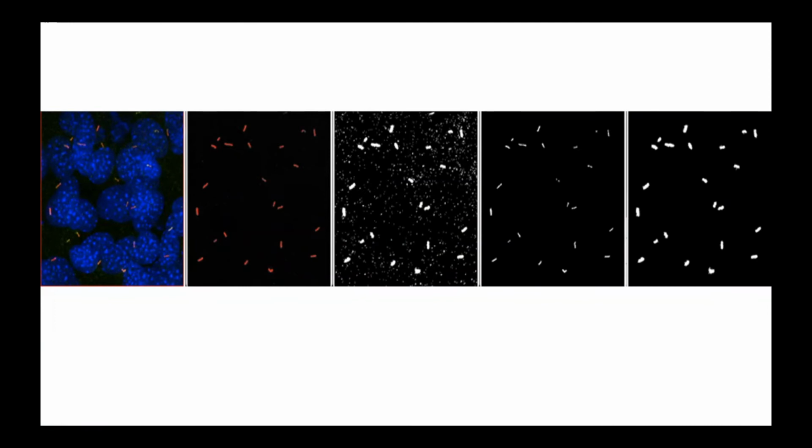So basically, this model allows you to use a high threshold to detect cilia, and you should set the high threshold in a way that in any cilium, there is at least one pixel that would be detected. The other pixel of the cilium will then be found based on the low threshold. As the low threshold, you should select a method that will detect all pixels of all cilia, but eventually also falsely detected background structures that are not cilia.